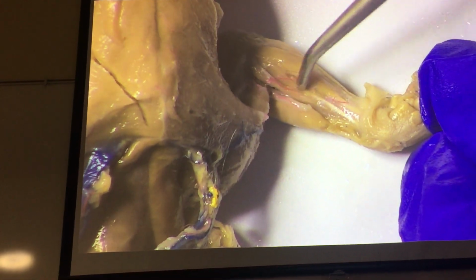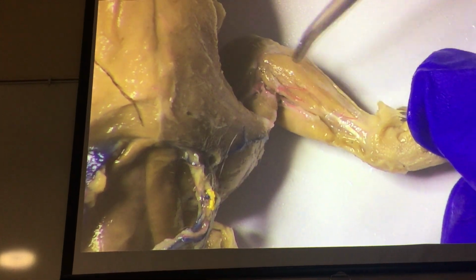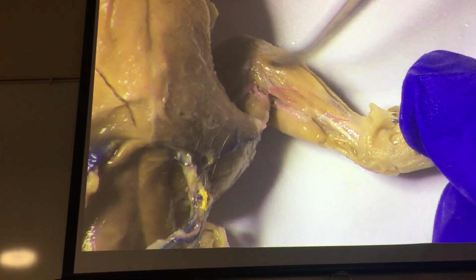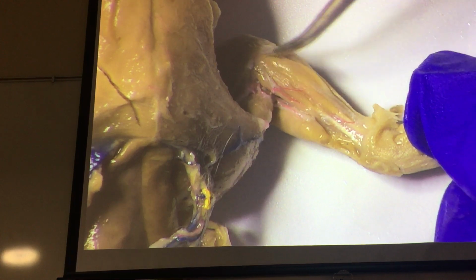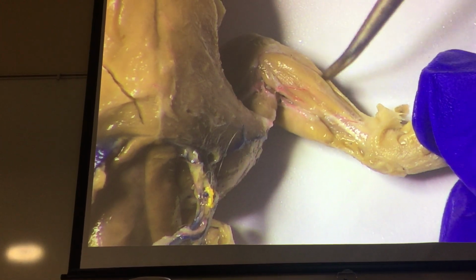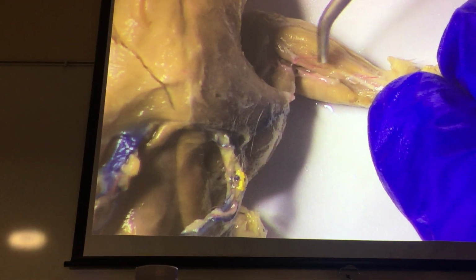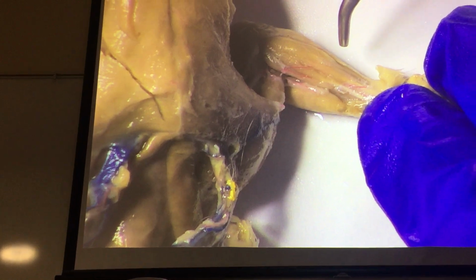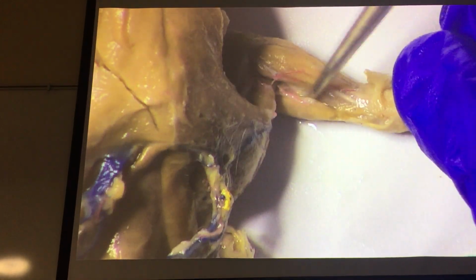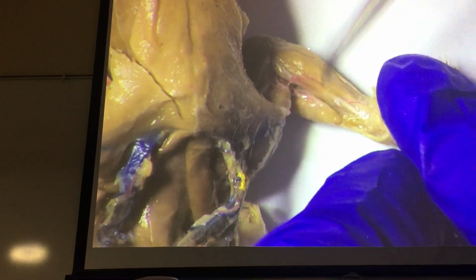Next to it, flexor carpi radialis. The dominant muscle, not dominant, but kind of dominates your field of view here with its nice oblong shape, is palmaris longus. And now we're on the ulnar side, so flexor carpi ulnaris. So for the ventral forearm, it goes PF, PF, if that helps. And then of course here we have our extensor group, just like your own forearm. You've got extensors and flexors, so same thing.